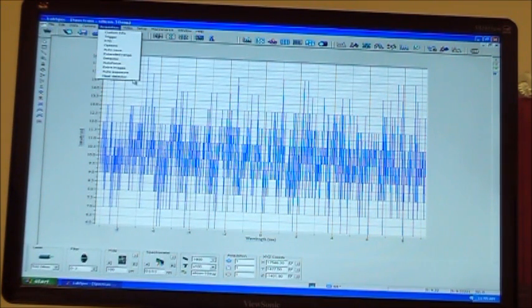And then down here's a button for heat detector. It's for when you want to shut the system down. To be honest, I really don't like using the heat detector button because, at least in the older versions of software, it seems to go slower, and it doesn't really update you or notify you when it's done, and you really don't know when the detector's warm and safe to shut off. I just like using the actual detector temperature window and manually heating the detector myself, because then you can monitor how fast it's heating and how fast it's cooling.